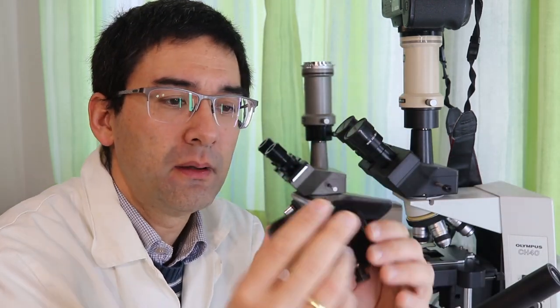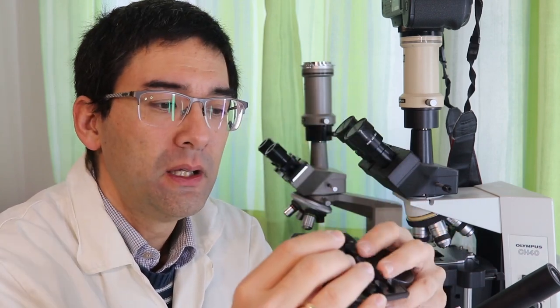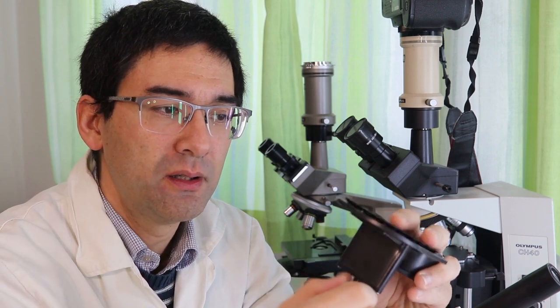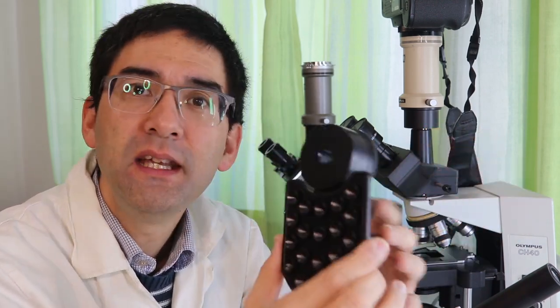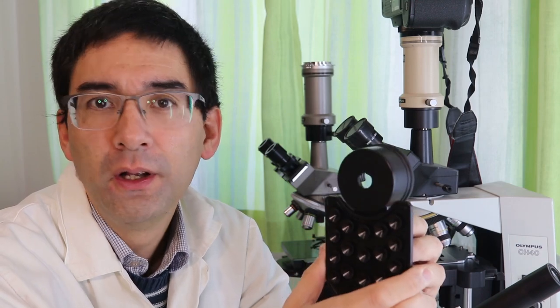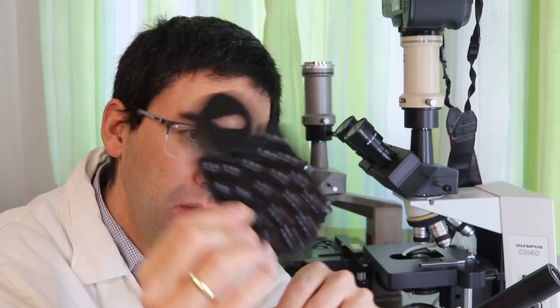So now about the things where I was a little bit disappointed. And not only a little bit disappointed, but very disappointed. I already showed you this mobile phone adapter, and I really think that this mobile phone adapter is a good idea. I like the concept. It allows you to adjust the distance of the mobile phone to the eyepiece. I've seen mobile phone adapters before that did not work as well as this one. So that is first of all the good thing here.